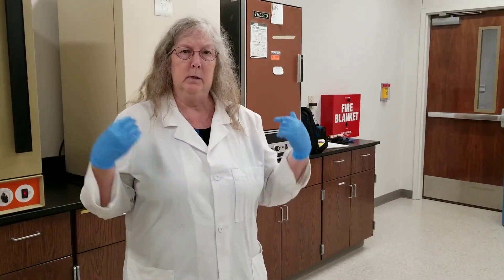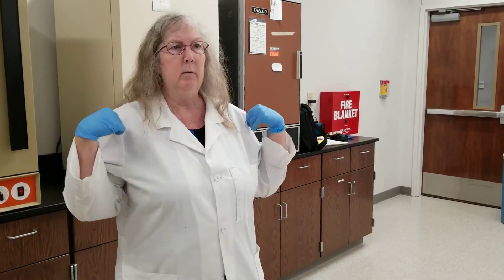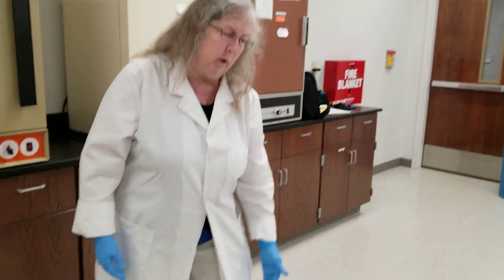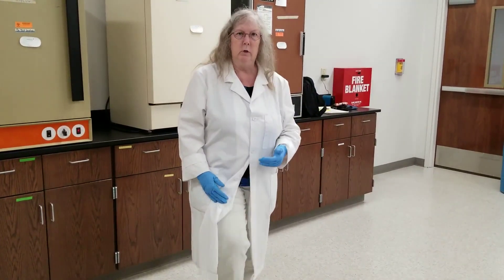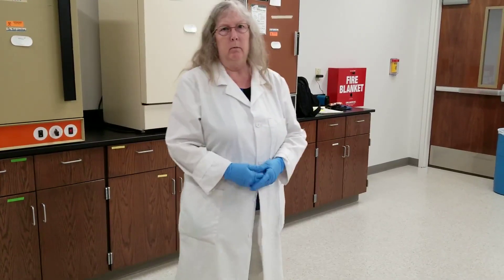You cannot have open-toe shoes in the lab. You cannot be wearing shorts. You can wear a lab coat over your clothes, but you cannot be wearing sleeveless tops — you need to have at least partial sleeves, and preferably your lab coat on. The general rule of thumb, established through federal guidelines, is that when you are seated, your knees need to be covered — whether you're wearing shorts, a skirt, capris, or whatever. That gives you a rule of thumb as to how long your clothing needs to be.